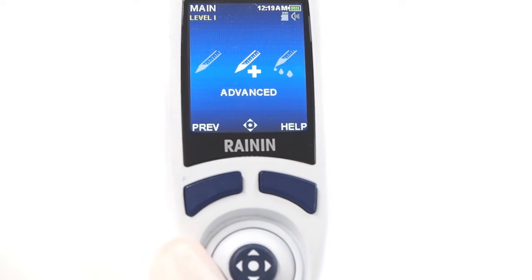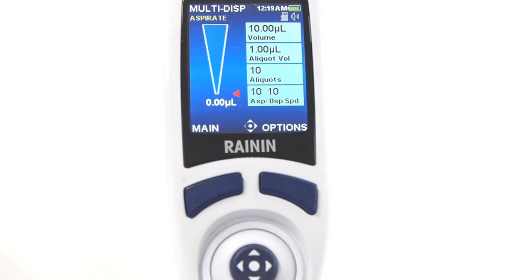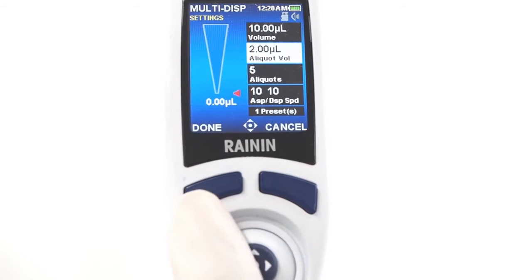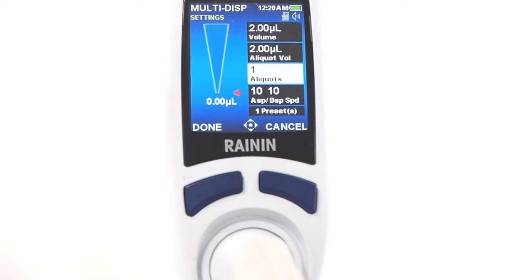One of the E4's most popular modes is multi-dispense. It's a time and effort saver when you need to fill a plate with multiple columns of reagent. Aspirate just once and dispense multiple aliquots from the same tips. On the E4, shifting aliquot volume can change the number of aliquots based on the initial volume set. With a 10 microliter volume setting, an aliquot volume of 2 microliters can only be pipetted 5 times. Shifting the number of aliquots can also shift the initial aspiration volume.